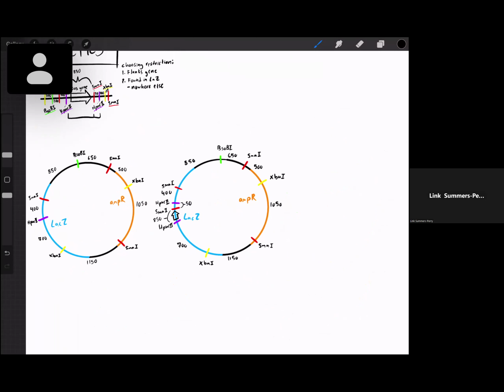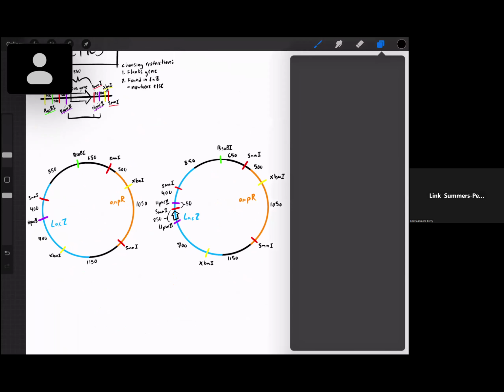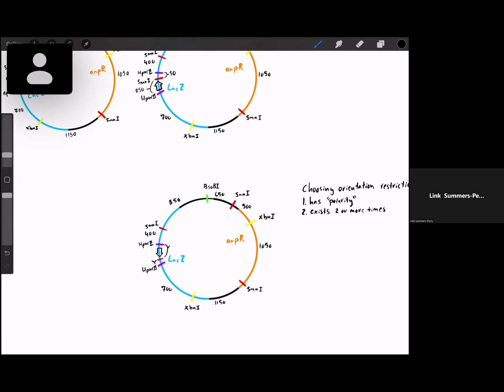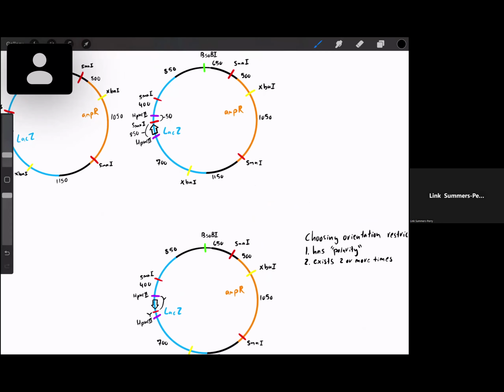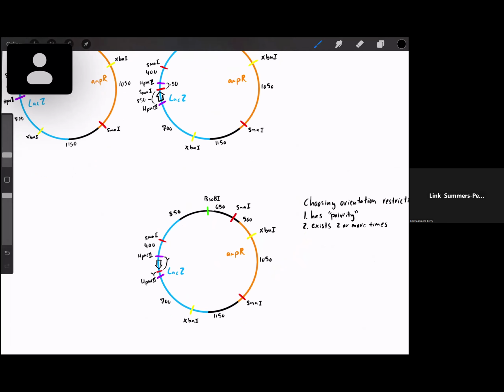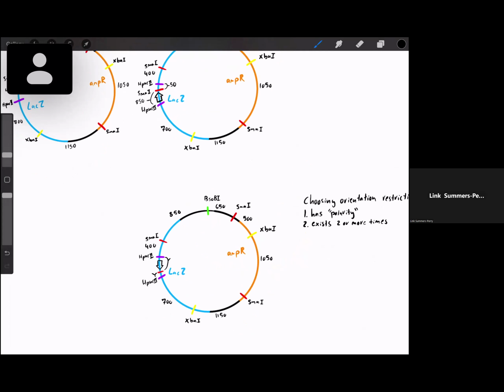We are now going to look at the reverse orientation right here. So in this case, the gene is pointing away rather than toward, and we can go ahead and write out the same base pair information that we did for the forward orientation.